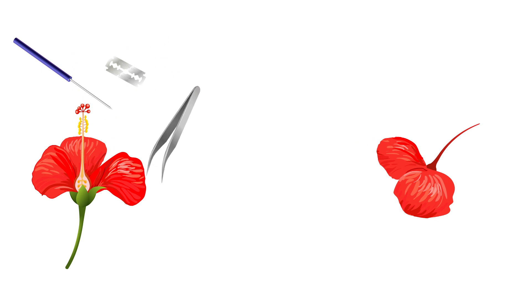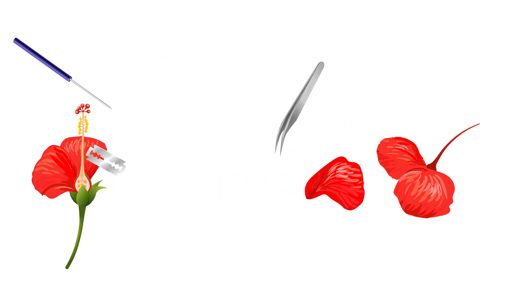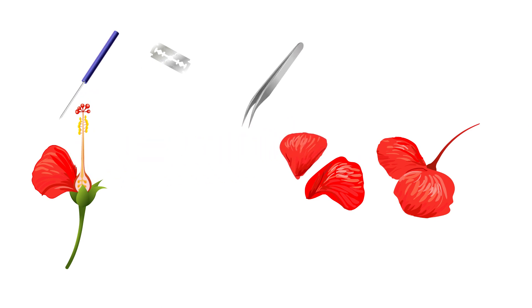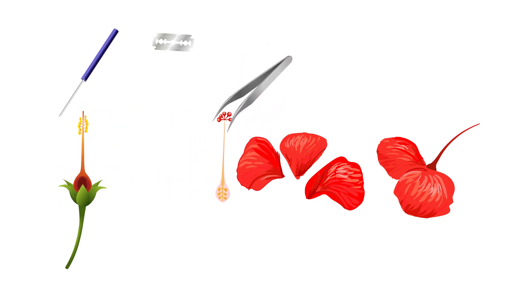Using forceps and needle, tear off the petals longitudinally without damaging the carpel. You will also need a blade in addition to the forceps. Separate the individual parts and place them out on paper using forceps. Take out the stigma along with the style from the carpel.